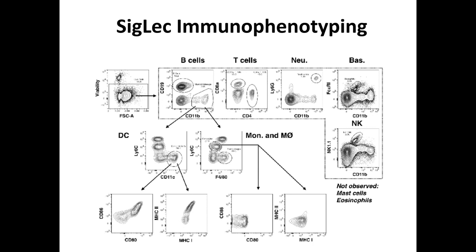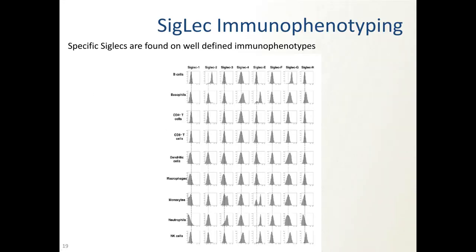So here's a case of him looking at all these different cell subsets, and all these different cell subsets will have different levels of expression of these different carbohydrates. And so you could cross-reference all this. And in this perfect world, we would be able to sort it all. Okay, so now Bigfoot's finally working. Let's get him to prep this.